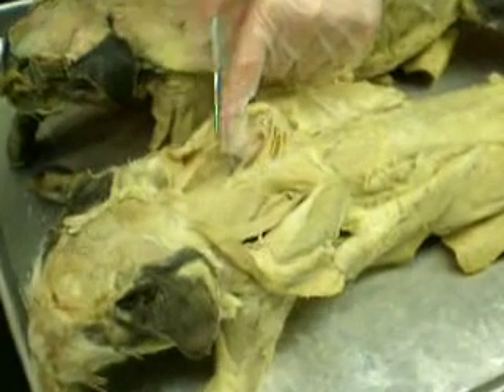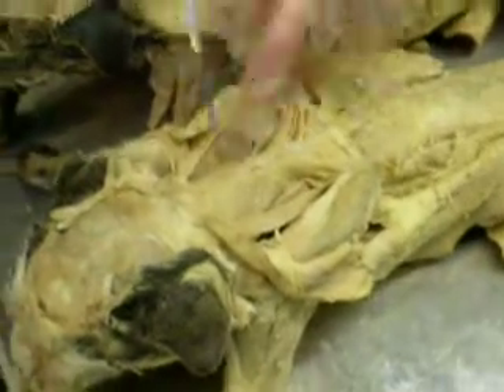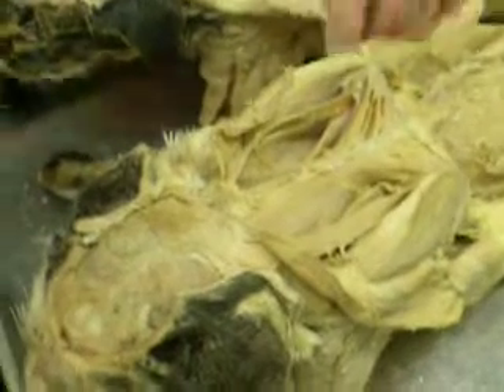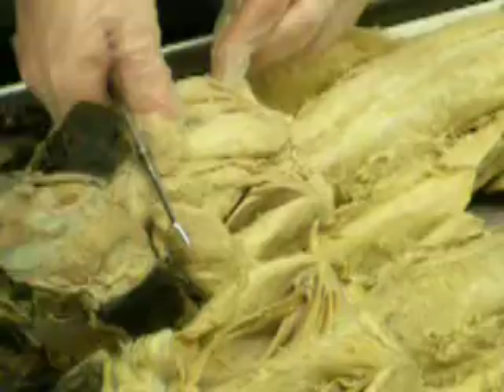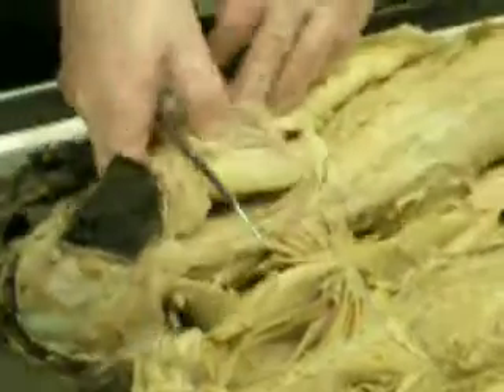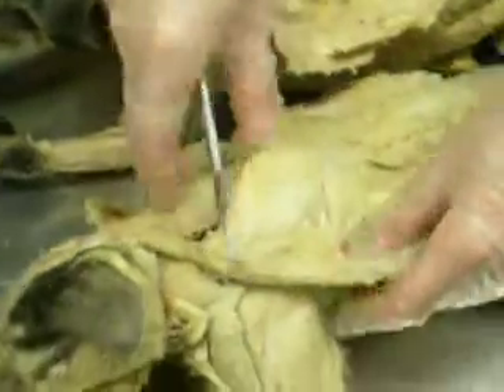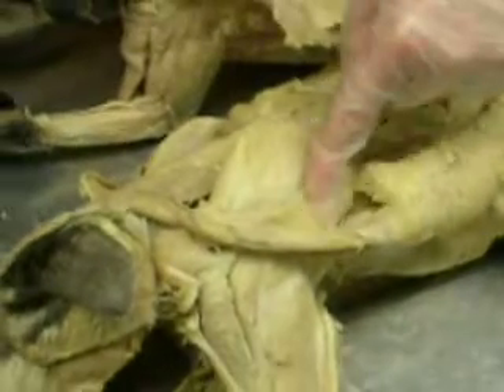The muscle of the neck — all of this is splenius, everything is splenius. These are the deep muscles of the scapula. You pull aside all the trapezius and deltoids and all that, and when you do that, you can see the muscle above the spine.